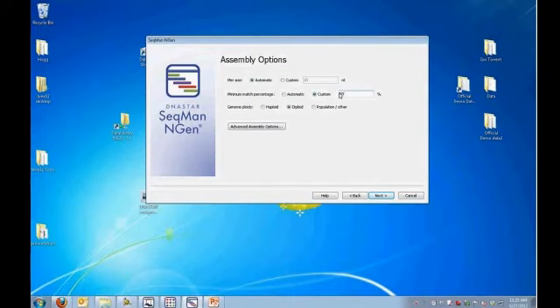The genome ploidy is used by our statistical SNP caller. We use a Bayesian statistical method, and it's a slightly different algorithm for diploids, haploids. When we choose population or other, we do not apply statistics. Instead, we look at the depth of coverage and the quality scores at the SNPs. Typically, these are deep assemblies where it's a mixed population of sequences.